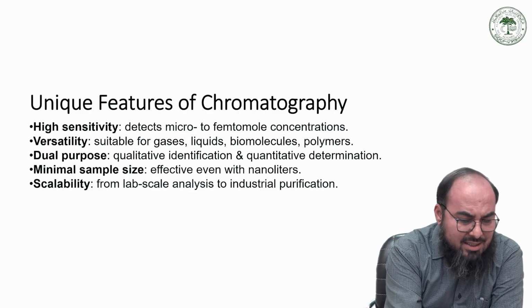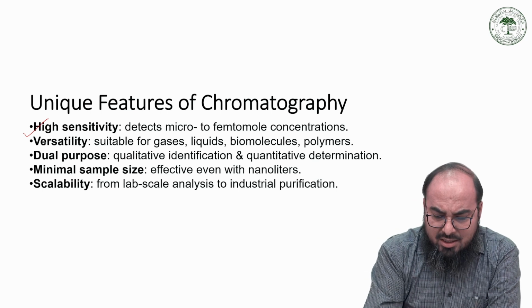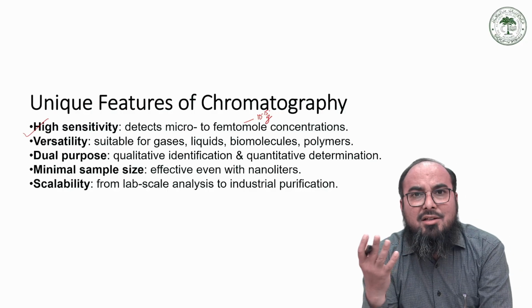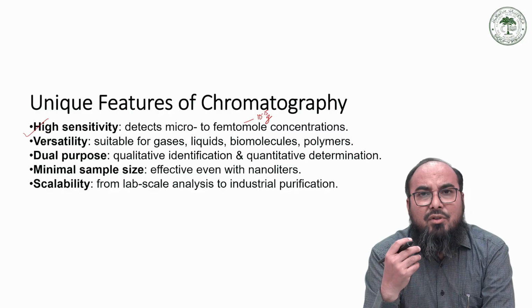It is because of the high sensitivity. Now you can detect femto level concentration, that is up to a level of 10 raised to the power minus 15 gram. You can understand the sensitivity, such a high sensitivity. Similarly, versatility.